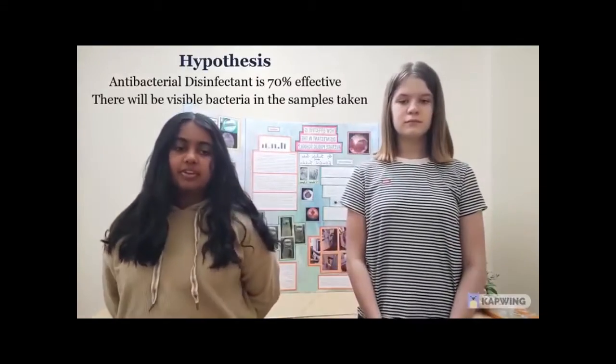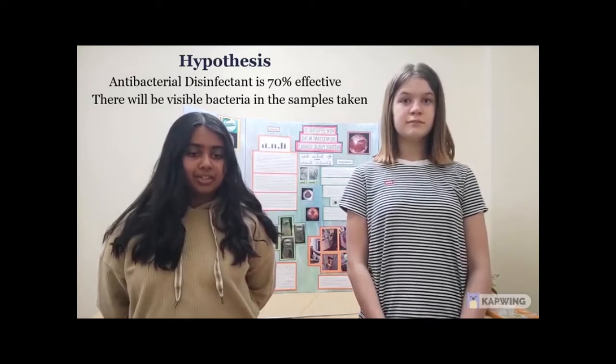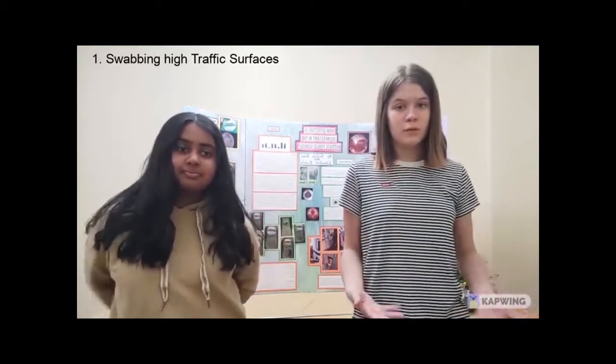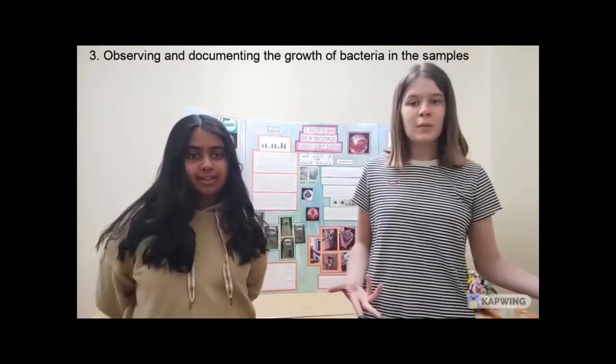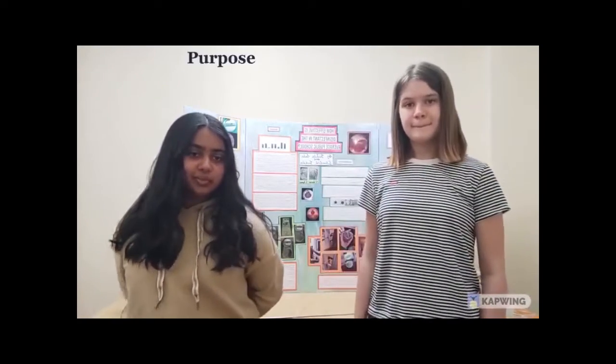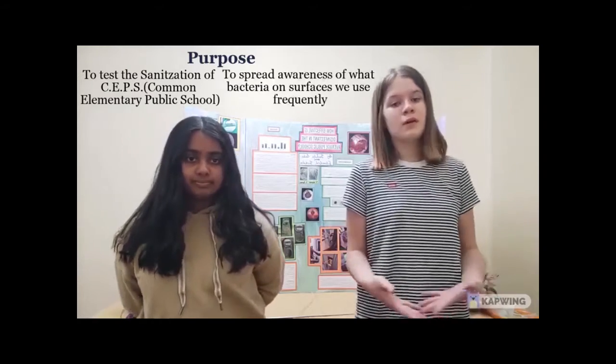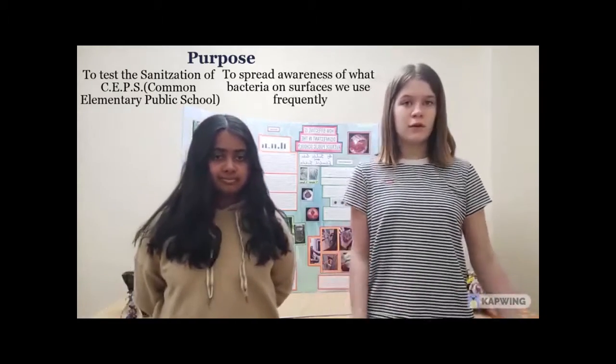We also hypothesized that there will be visible bacteria in the samples taken from a CEPS, Common Elementary Public School, despite students and staff sanitizing their hands and janitorial staff sanitizing surfaces. Our project basically consisted of swabbing places around our school, incubating the bacteria swabbed, observing how much bacteria grew, and testing the effectiveness of the school sanitary products. The purpose of this experiment is to test the sanitation of a CEPS. It is also to spread awareness of what bacteria linger on surfaces that we use in our daily lives.